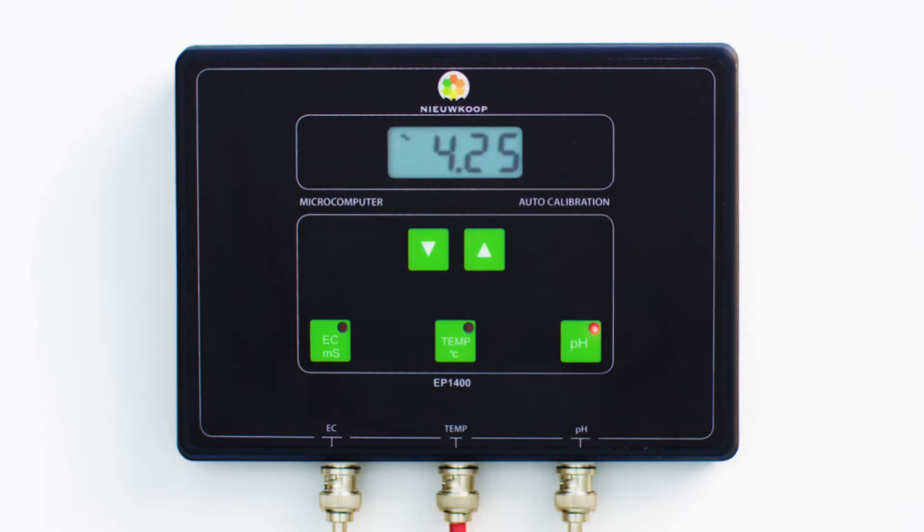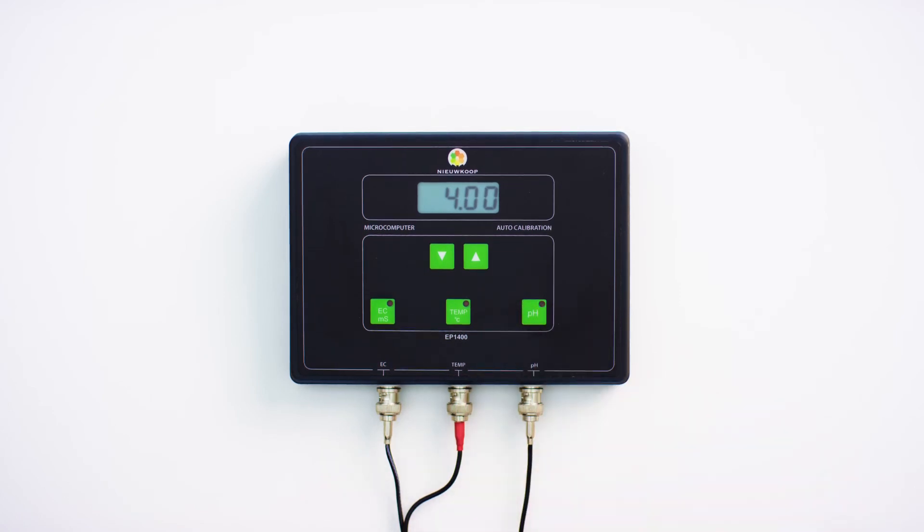The reading will blink and the tilde sign will appear again in the top left of the screen. The instrument is now calibrating. When the tilde sign disappears and 4.00 is visible in the display, it means that the instrument has finished calibrating. Now press and hold the pH button until the LED starts flashing. The pH of the EP1400 is now calibrated.